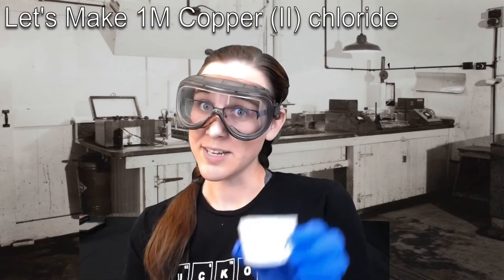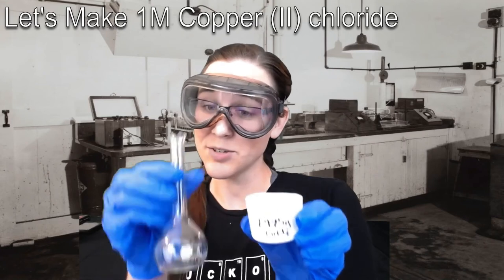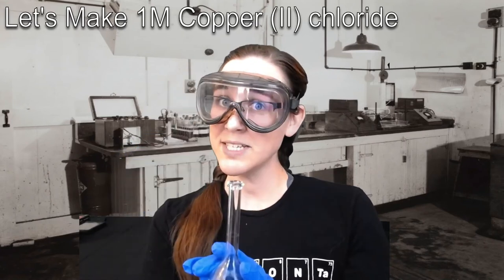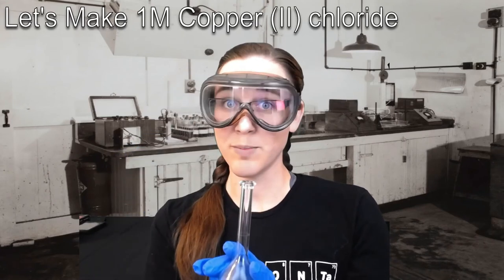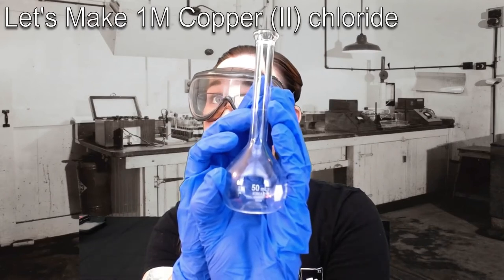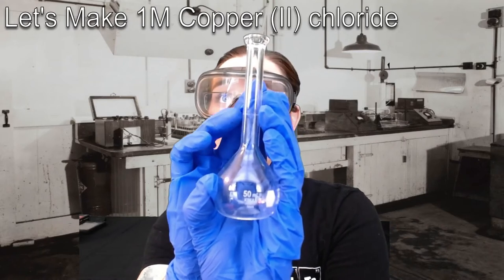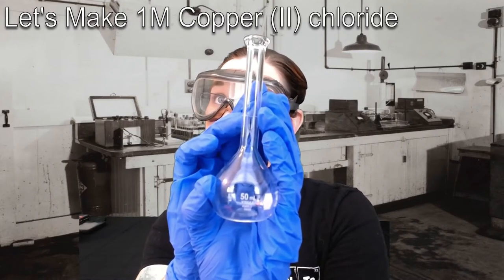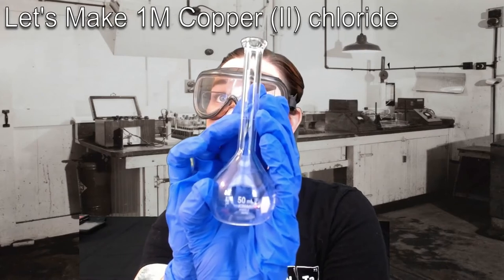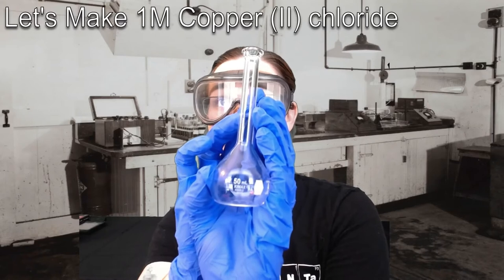The next thing I need to do is take my massed out solid CuCl2 and add it to a volumetric flask. The reason I'm using a 50 milliliter volumetric flask is because a 50 milliliter volumetric flask is much more accurate at measuring a solution's volume. Notice this little line right here on the neck of my volumetric flask. That's where I'm going to be filling the water up to to have a very precise exact measurement of volume.